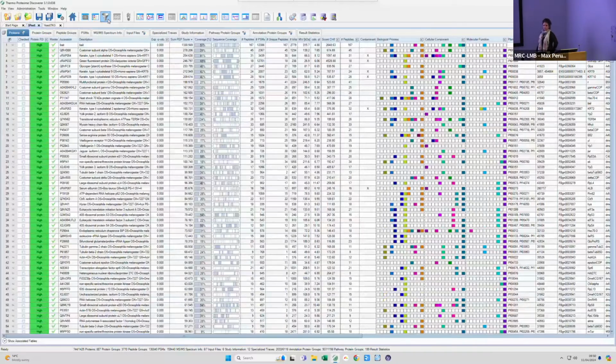Okay. So usually the same steps. This data set was actually done using DIA. So it was not DDA, it was DIA. But you can see that we still process it in PD. If we were to use DIA-NN, or if we were to use Spectronaut, you would just receive results in a completely different way. So the good thing about PD is that once you learn it, you can see all your types of projects in the same platform. Again, this will change in the future because hopefully we'll have a bioinformatician that will support you much more and much better.